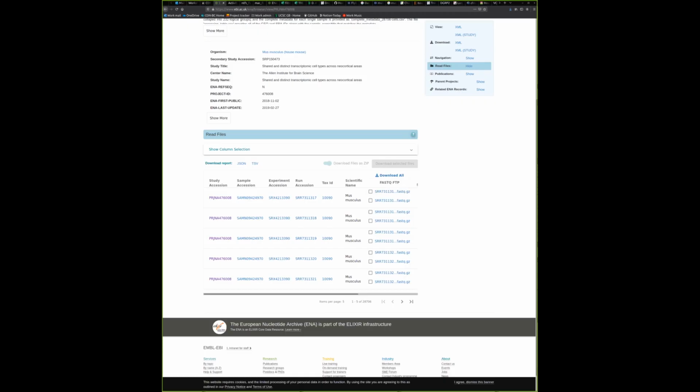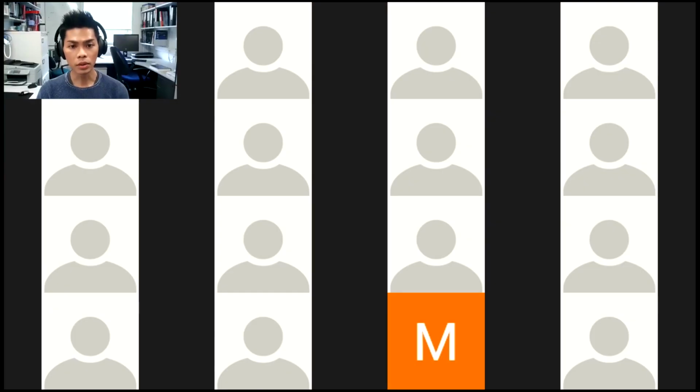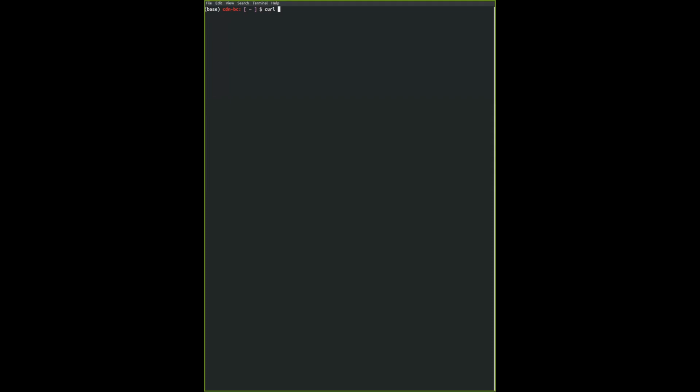Cool. So as mentioned, the function is called curl. So if you type in curl in the terminal, let me bring up this first. Okay, so it's called curl. I'm going to get you to input one flag, which is dash with a capital O. It's capital O, followed by the link. So on Mac, Command V should be fine. It pastes the entire link. On Windows, do a right click. That should paste the link directly into Git Bash. Should be no problem. Okay, dash O.